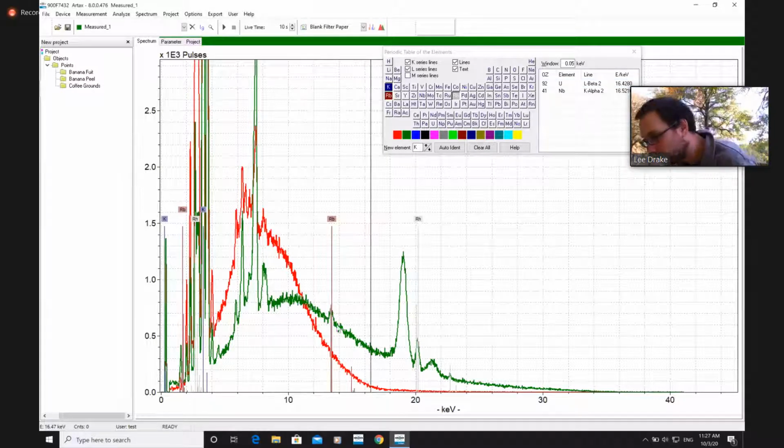But if you look here, the rubidium peak is really small. And below it is all this backscatter. This is the stuff that causes problems in XRF analysis, right? Because this is all the photon-electron interactions that don't have an easy explanation that are going on in the background because of our choices in geometry to make this instrument handheld. So we have to find a way to eliminate that background.